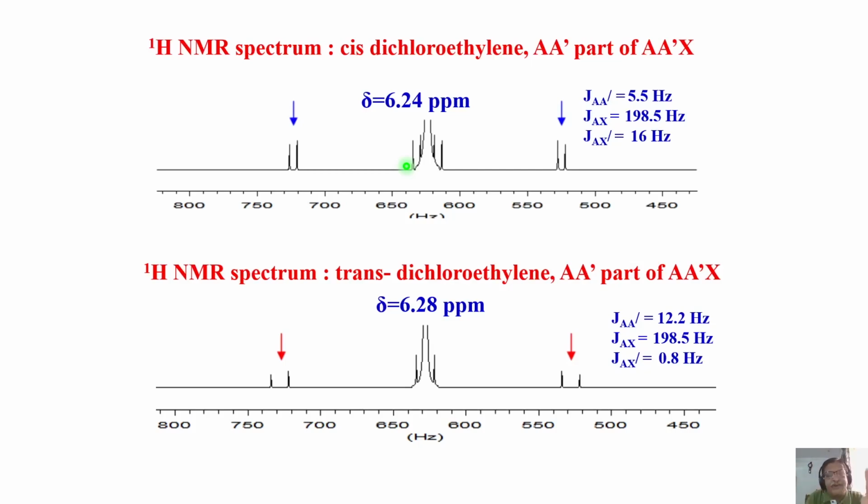One proton coupled to 3 different protons in 3 different coupling strengths. Then how did we measure that? This is an example. One of the ways is to break the symmetry by taking natural abundance carbon-13, or if possible label one of the carbons, then you have broken the symmetry. Then you are going to get all the couplings by analysis of the proton spectrum with carbon couplings. That is one way, very easily.